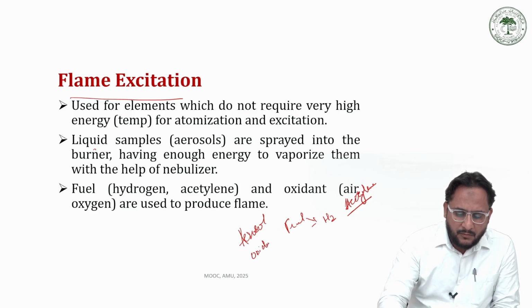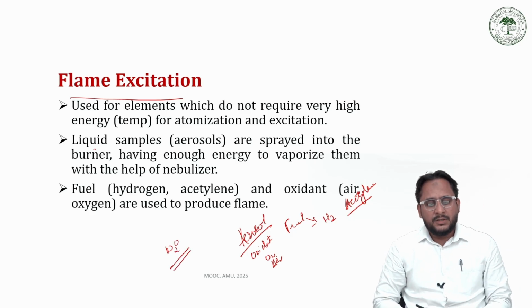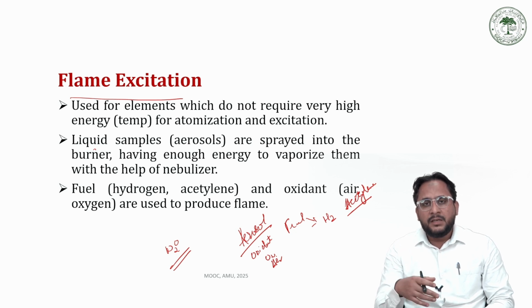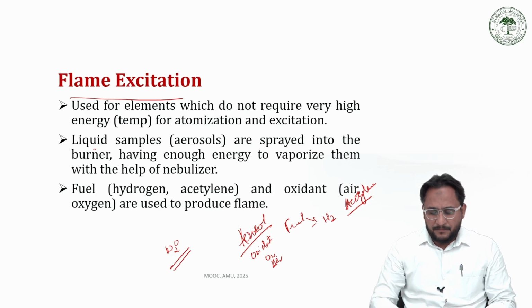So tell me what oxidant we can use. We can use oxygen, pure oxygen. We can also use air, and we can also use nitrous oxide, any of these oxidants. So generally we prefer either hydrogen or acetylene along with oxygen to produce the flame that ultimately causes the sample to vaporize, dissociate into individual atoms, and then finally excite those atoms.